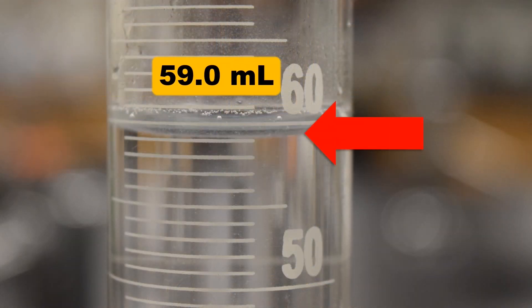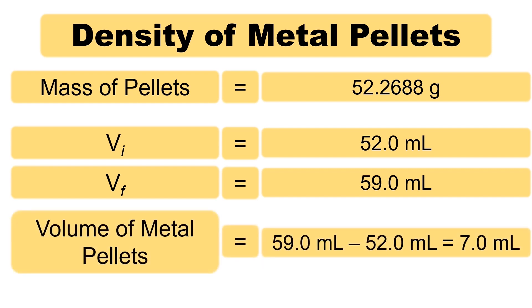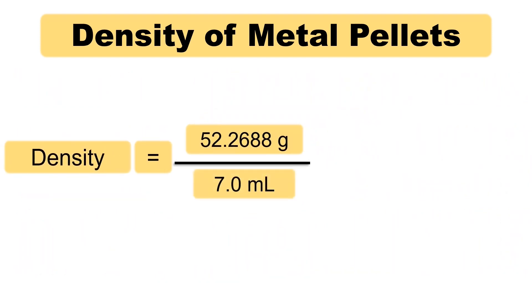Notice that the water level rises because of the volume occupied by the metal pellets. Measure the final volume, which consists of the water plus the volume of the metal pellets. Simply subtract the initial volume of water, and we can obtain the volume of the metal pellets. When subtracting the volumes, be sure to follow the significant figure rules. Then use the significant figure rules to find the density of the metal pellets.